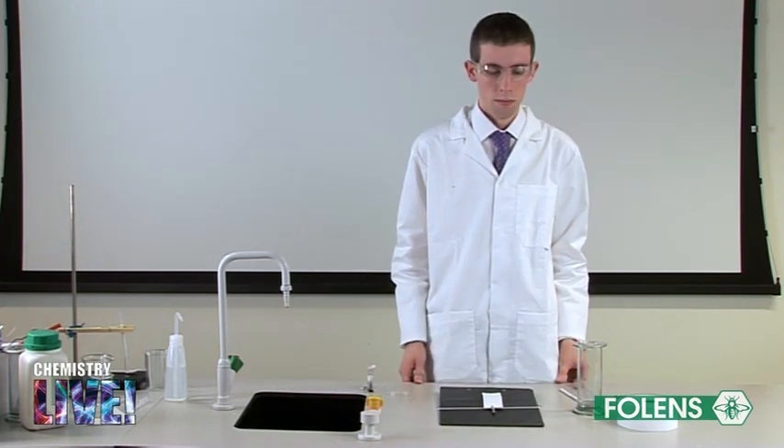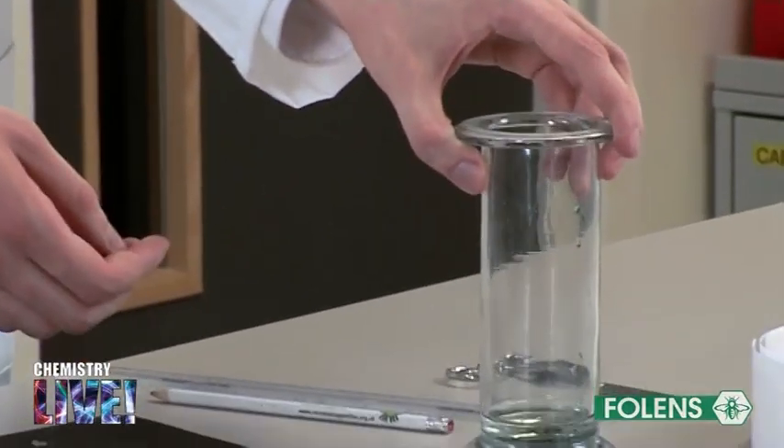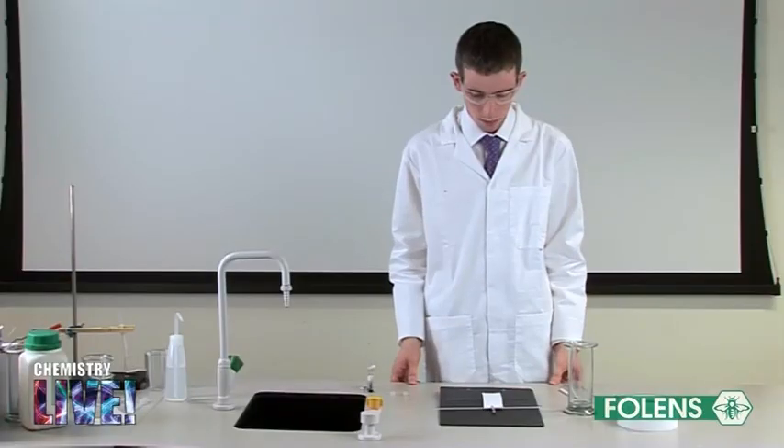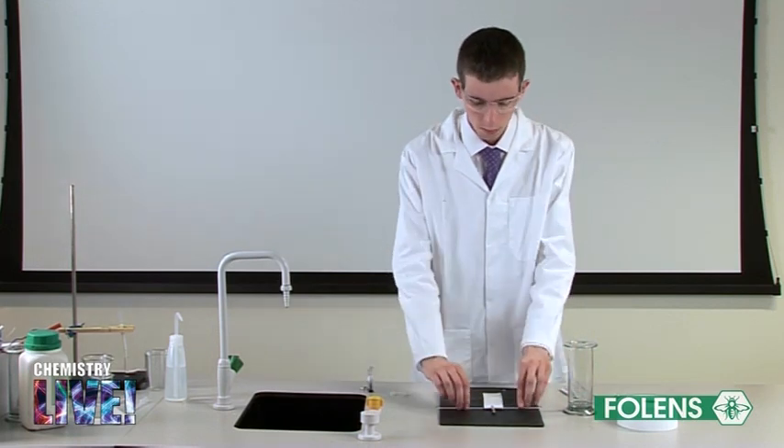Water was poured into the gas jar to a depth of about 1cm. If the samples are marked water insoluble, you will have to use organic solvents. Place the length of chromatography paper in the gas jar as shown.